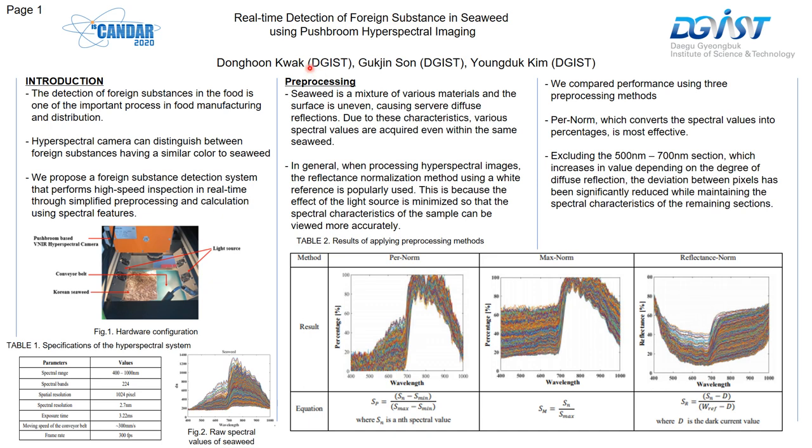My presentation is about real-time detection of foreign substances in seaweed using Pushbroom Hyperspectral imaging. Nowadays, the process of detecting foreign substances in food is mostly automated. And this is one of the most important processes in food manufacturing and distribution.